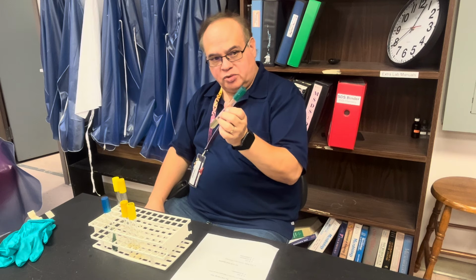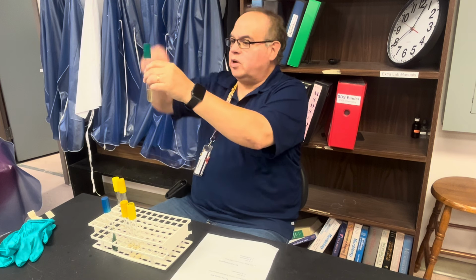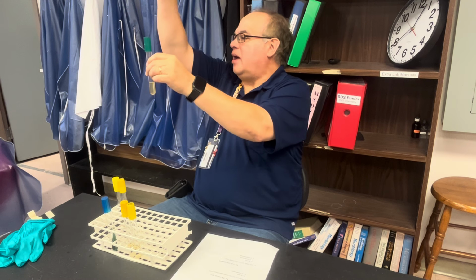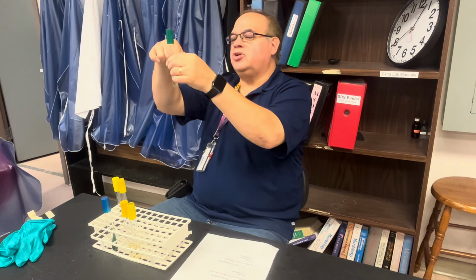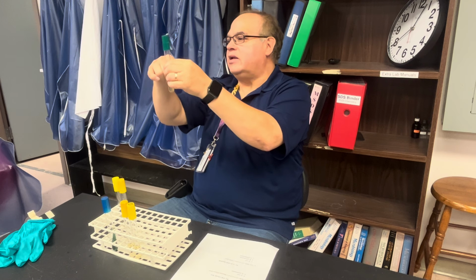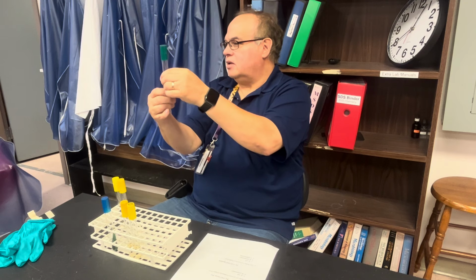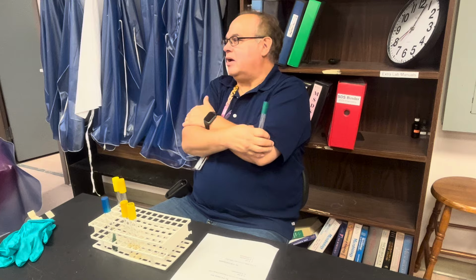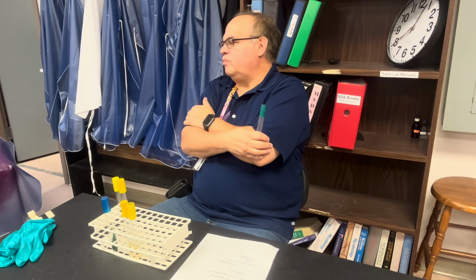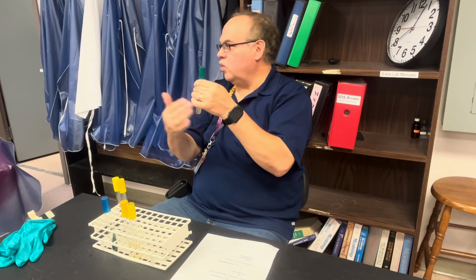The second attribute is it's a motility medium. So how are you going to inoculate it? With a straight needle, go about 3/4 of the way down and right back up. Now there's no indicator in here, so you're going to have to look where you inoculated and see if it's growing only at the site of inoculation or if it's growing away. These 2 tests will be confounded: the motility will be confounded by the hydrogen sulfide, because if hydrogen sulfide gets produced, it's going to look like it's growing throughout the tube.